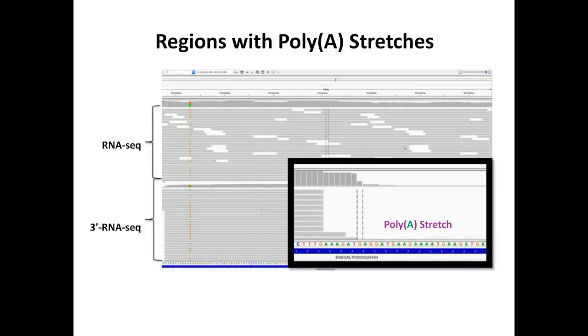So whenever we have this situation, the transcript downstream and upstream of that will end up in our cDNA library. So we have to come up with a parameter to delete all these reads, because these are not real ends of the transcript.